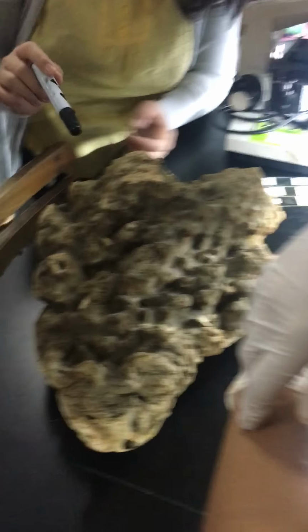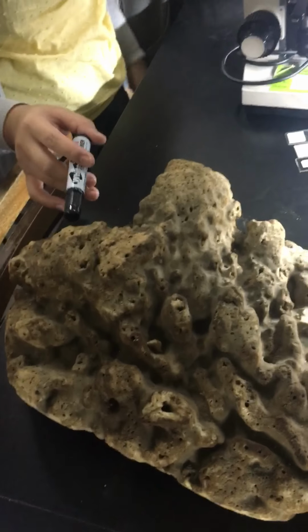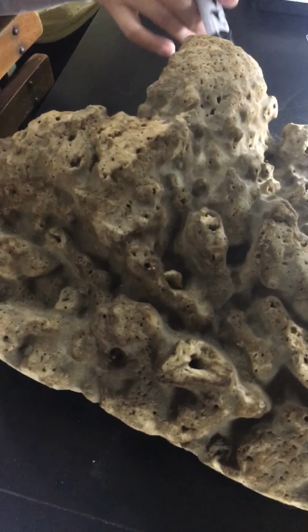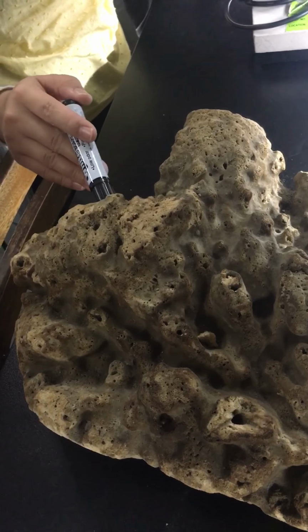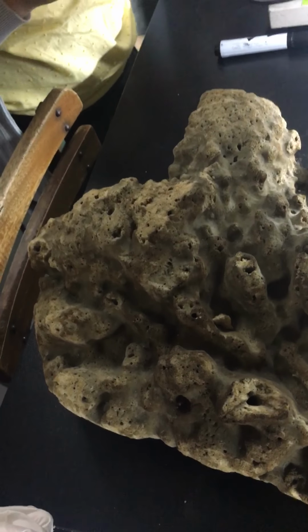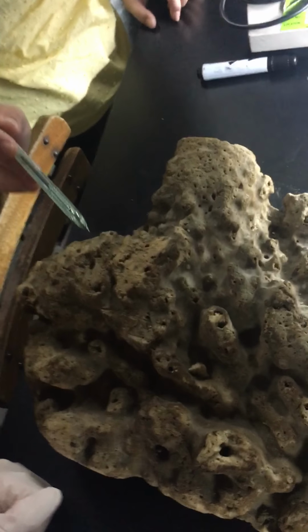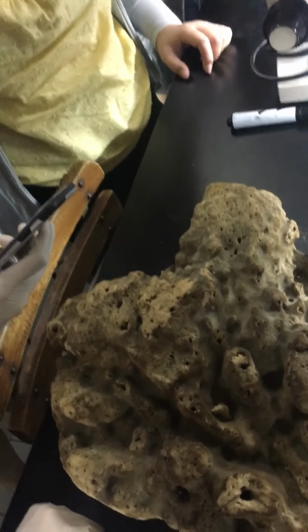So notice that, if you can see, they have a highly reduced spongocoel. Okay? Highly reduced spongocoel. And if you can see, the remaining parts of their body are actually chambered. Okay? So this is what I was telling you about, the radial canal. These are radial canals which are lined by choanocytes.